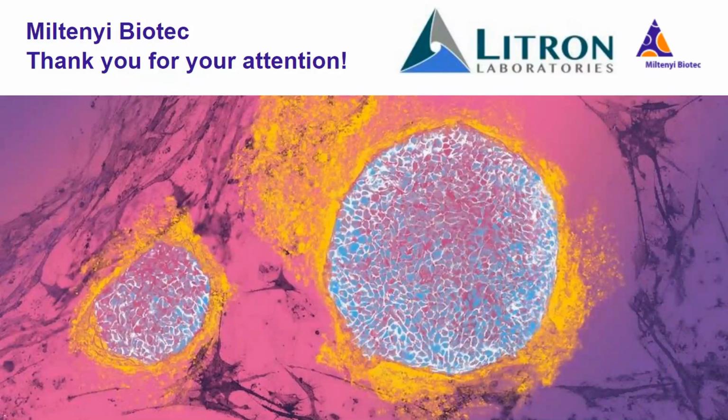for those tox studies, because maybe you're conducting this study for numerous other reasons. You're getting histopathology, you're getting TK, PK, all those other components that you generally get in toxicology studies. And maybe one of those is the contributing factor to the dropping of that particular compound. You blew out the liver or something like that. If you froze your samples away for, say, Pig-A or mutational assessment, you don't have to run them right away. You can store them for months at a time and get back to them.